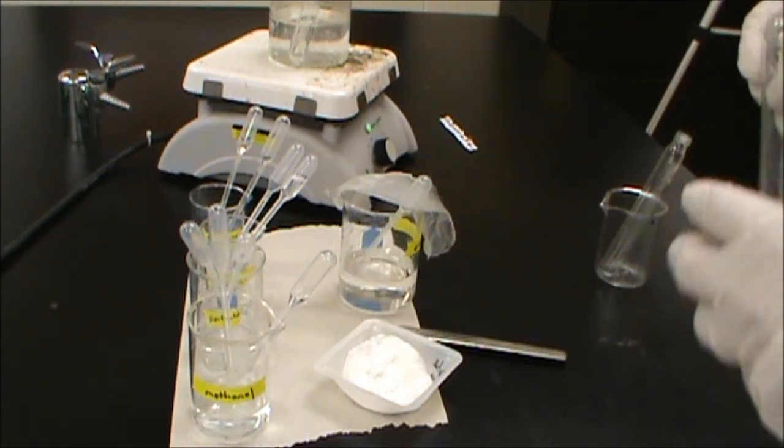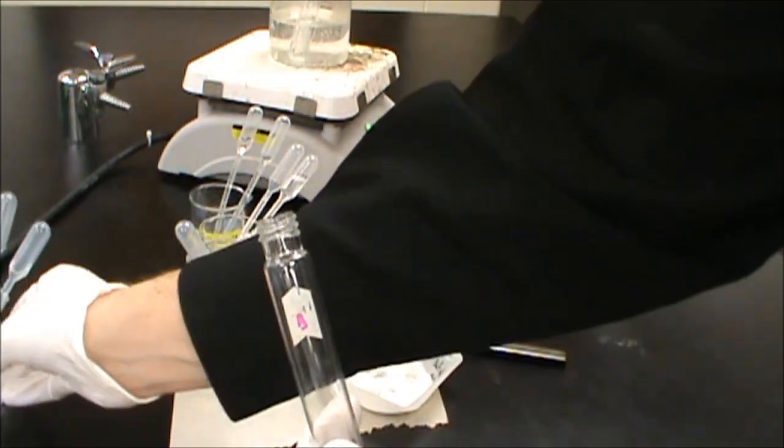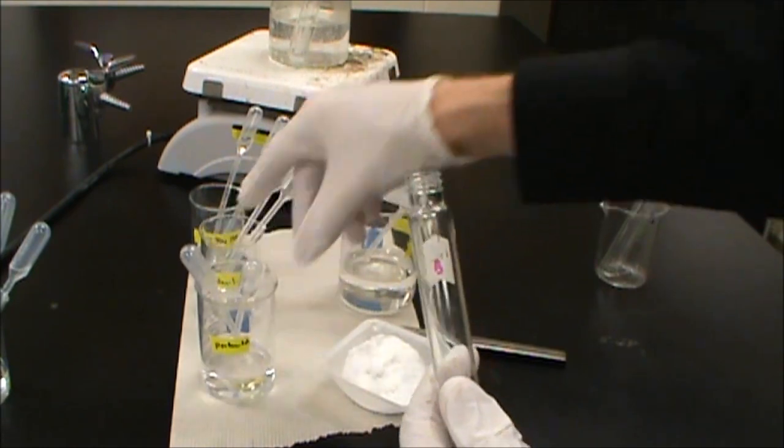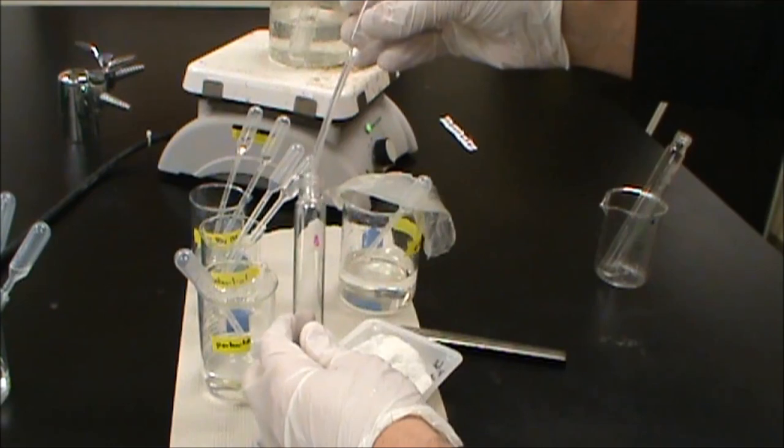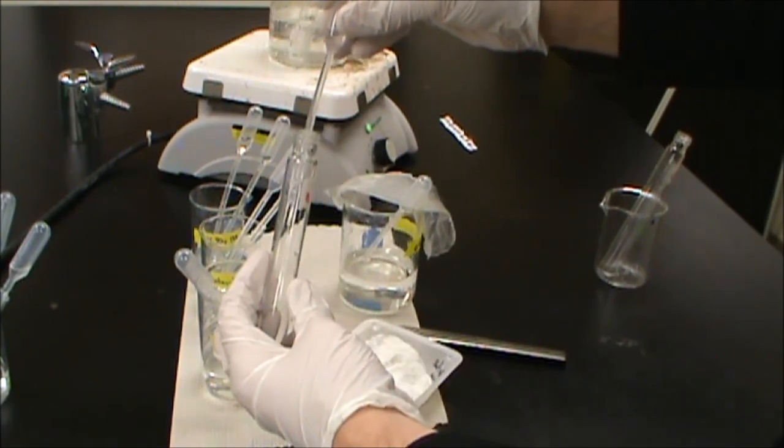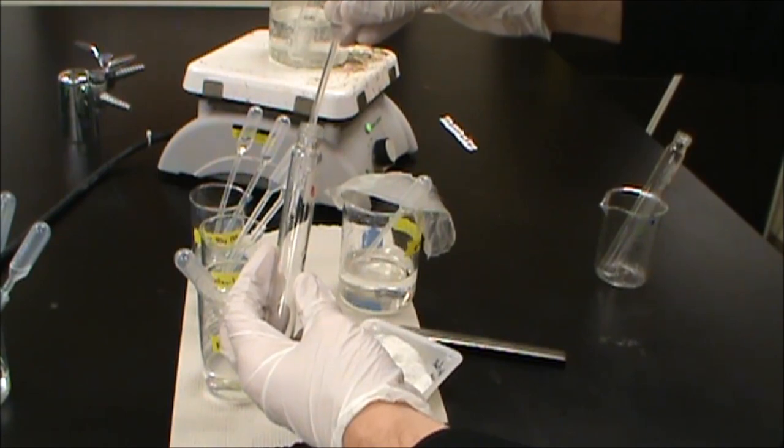Then we're going to go ahead and start our second one. So test tube B. So for that, we're going to take pentanol, pentan-1-ol. And we're going to do about 20 drops of that.